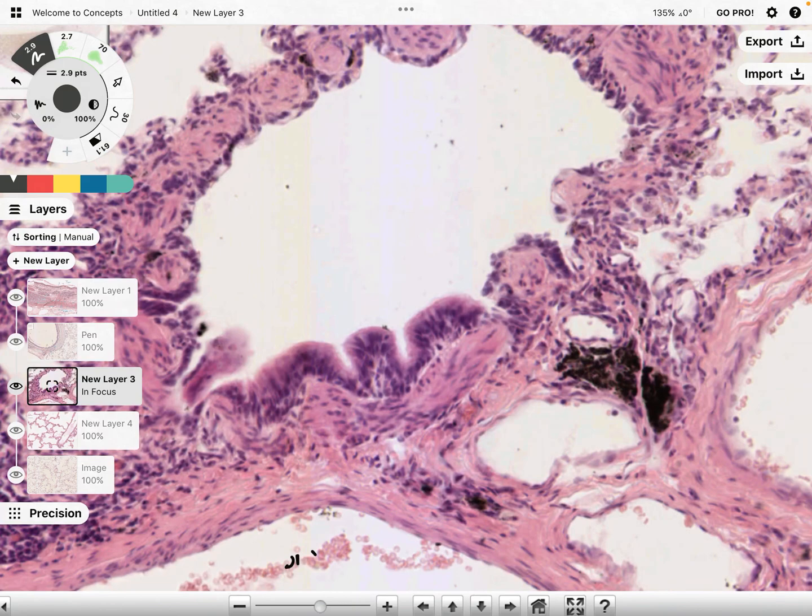Next, we're going to look at an actual bronchiole. So one of the major differences that we can see here is the fact that the bronchiole does not have the hyaline cartilage. So hyaline cartilage is absent. So I'm just going to do a negative hyaline to denote the fact that you don't see hyaline cartilage in the bronchiole. It's lacking. There is, however, lots of smooth muscle. So we still see smooth muscle in this area.